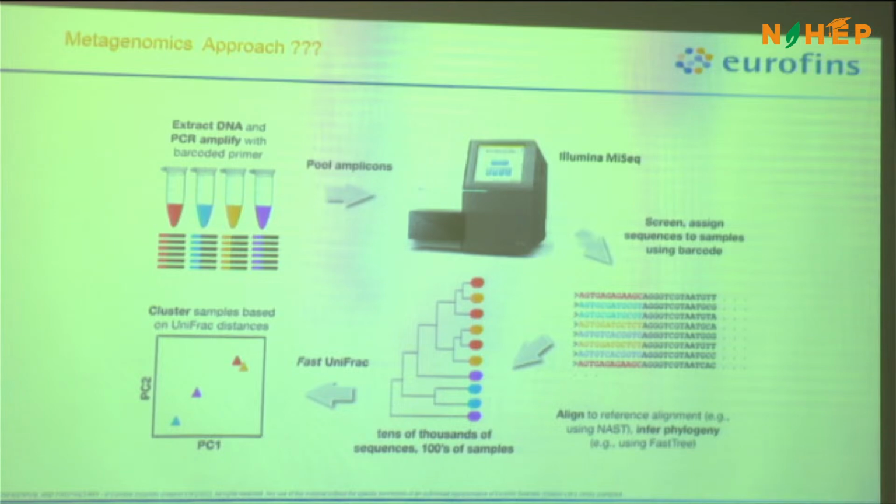In this, we know the abundance: what the organisms are and what percentage of each organism there is. If you want to do only the abundance part of it, then we go with amplicon-based approaches. But if we want to see what is happening at a gene level, what the functional abundance is, what the functional changes or functional categories are, then we have to go with shotgun metagenomics. We will talk about those things.